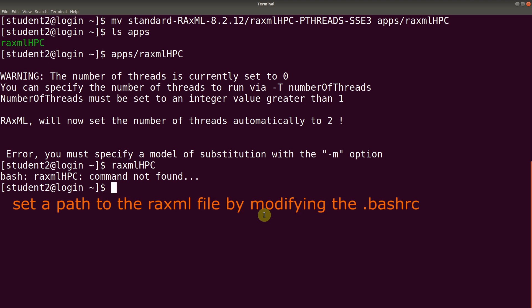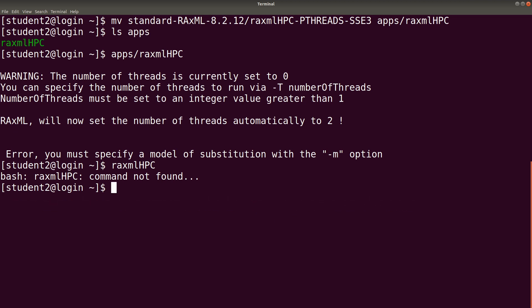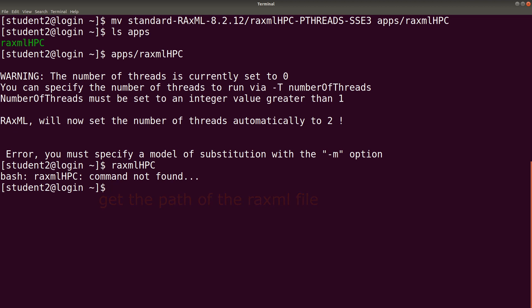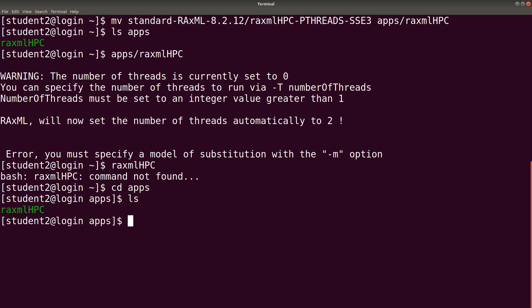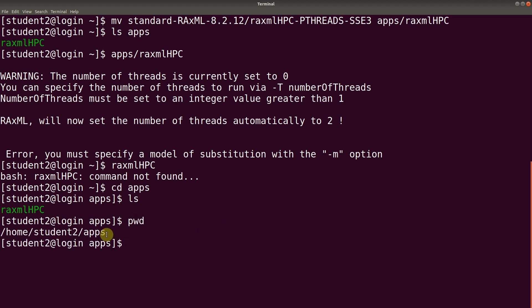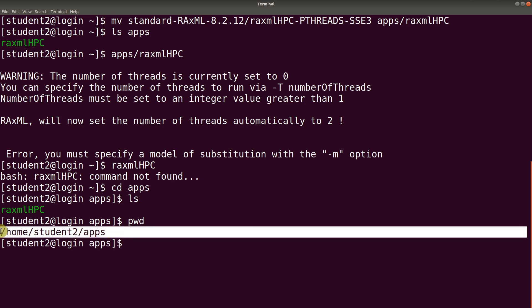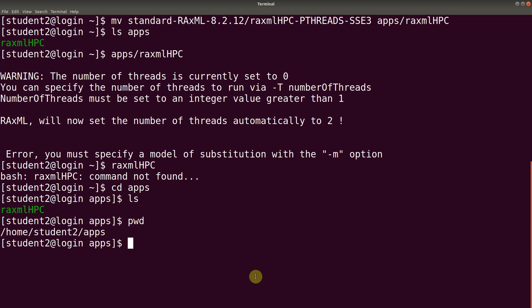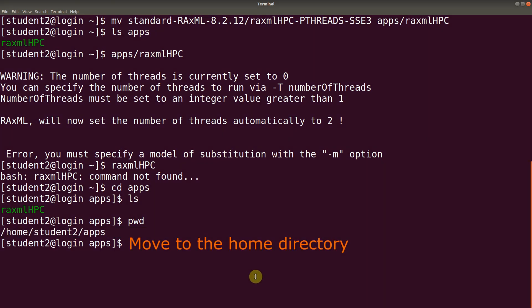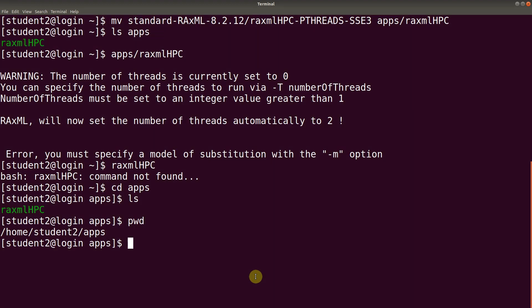That means we are going to modify the .bashrc file. First of all, let's get the path of the directory where the raxml binary file is. We will therefore cd to the apps directory. Of course, when we do ls, raxmlHPC is there. We want the path of this directory. So we say pwd. So this is the path we want. Please know that yours might be different, so take note of whatever path is displayed for you. Now let's cd back to our home directory.